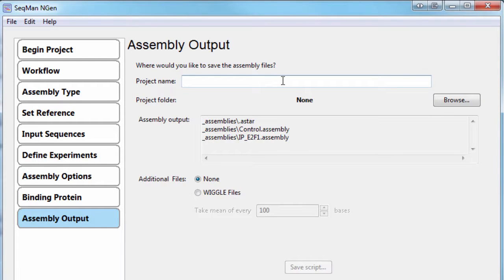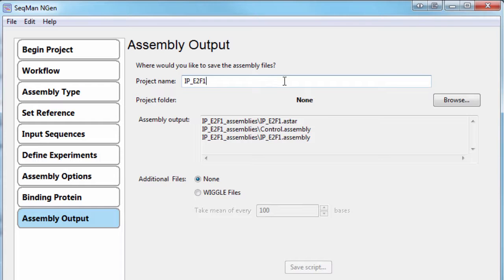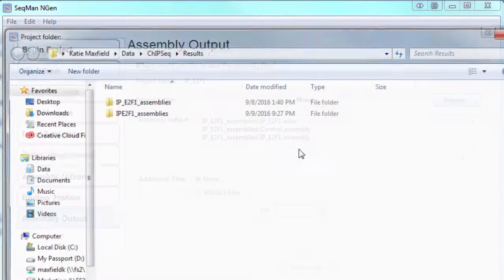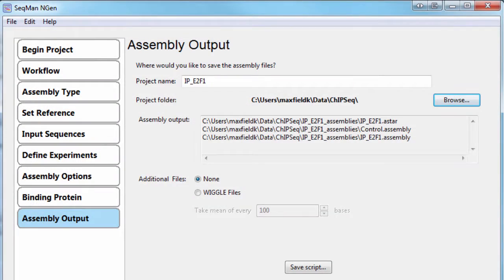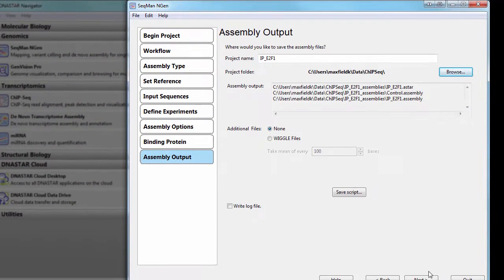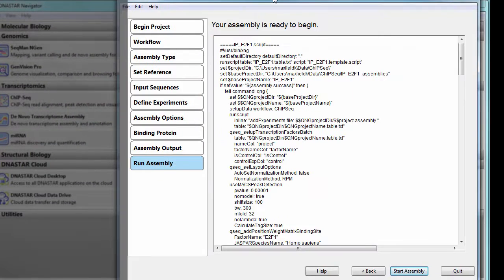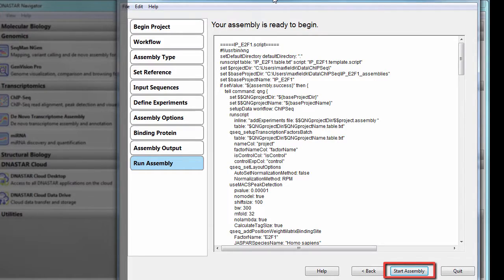Finally, I just need to name my project and specify a save location. Here, you also have the option to save a wiggle file. Then, start the assembly.